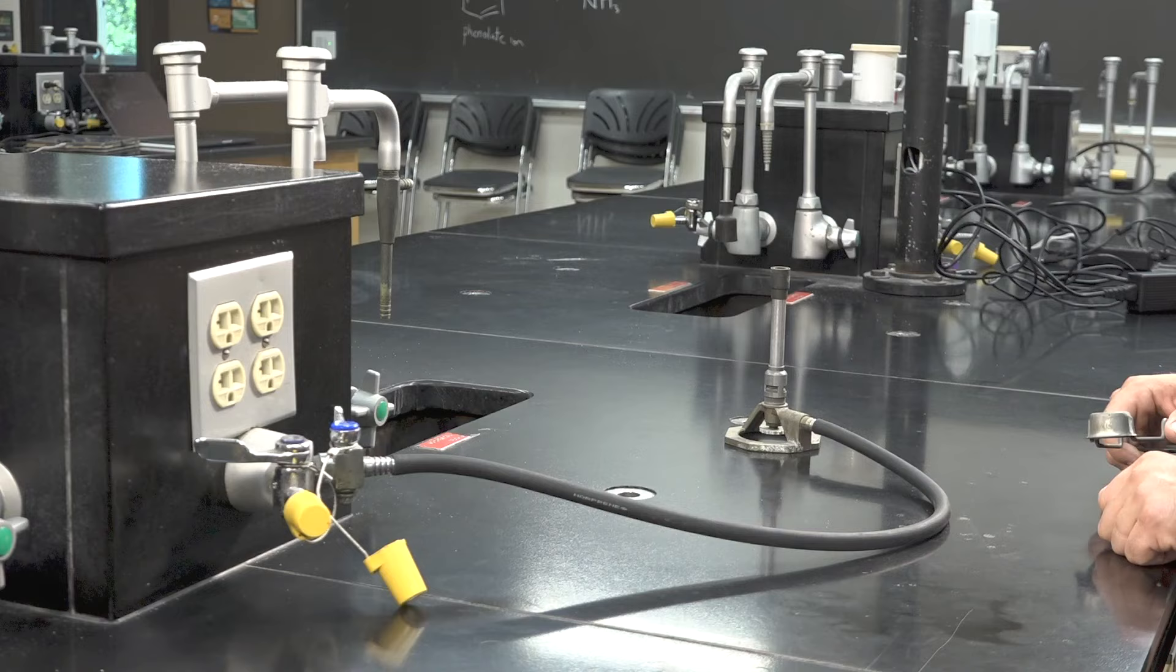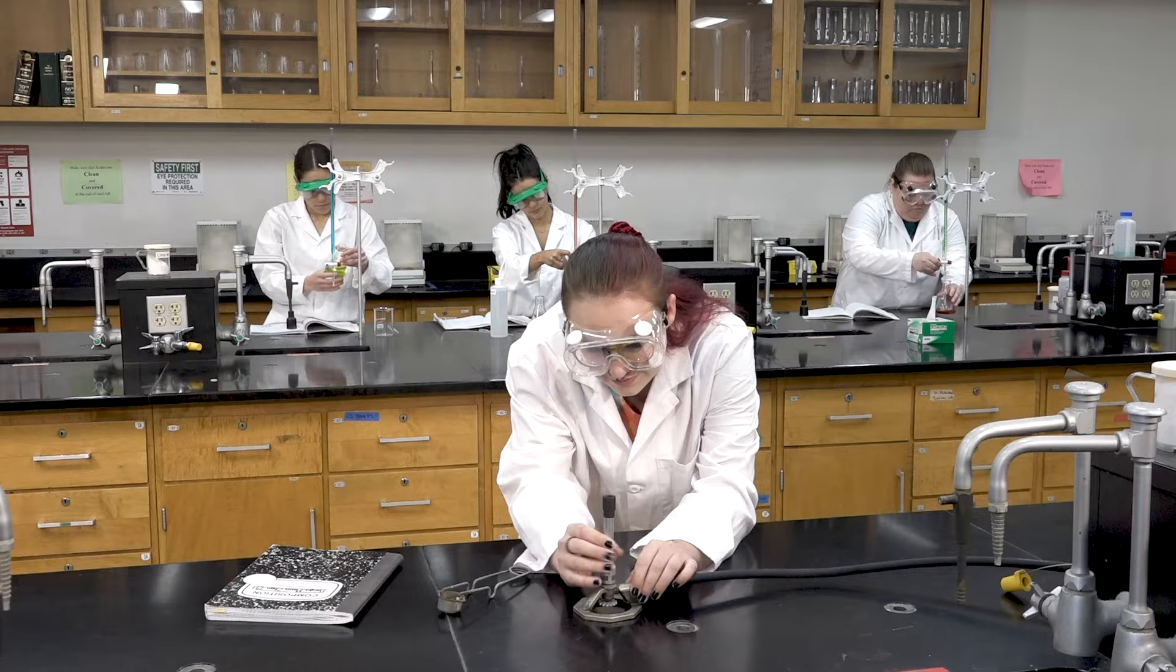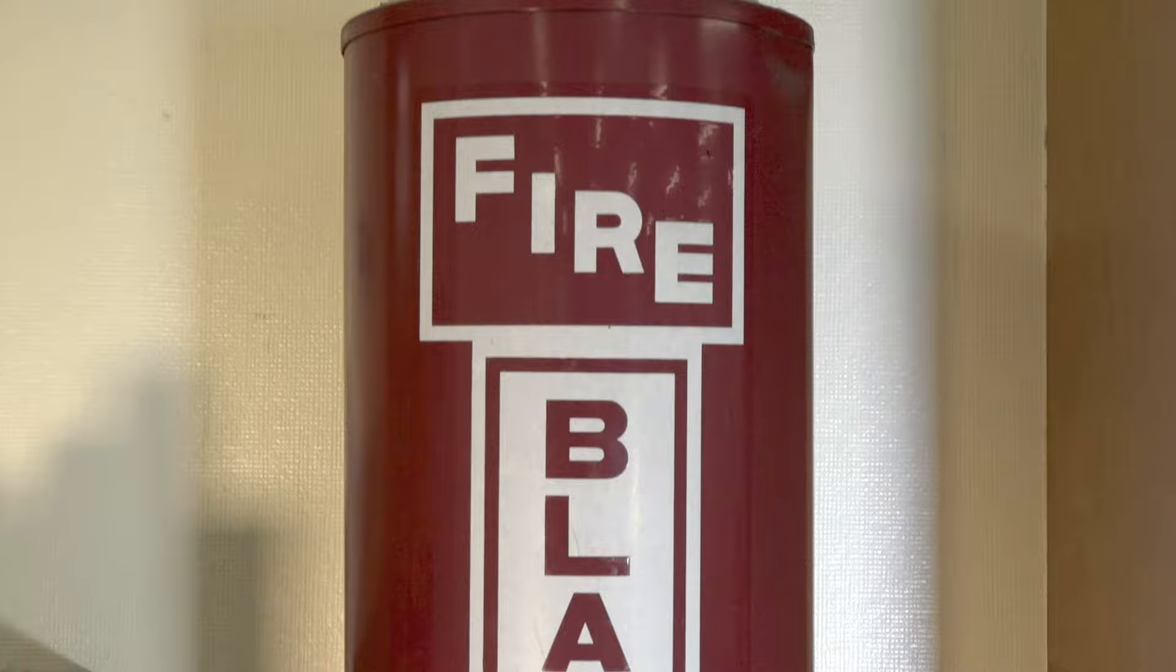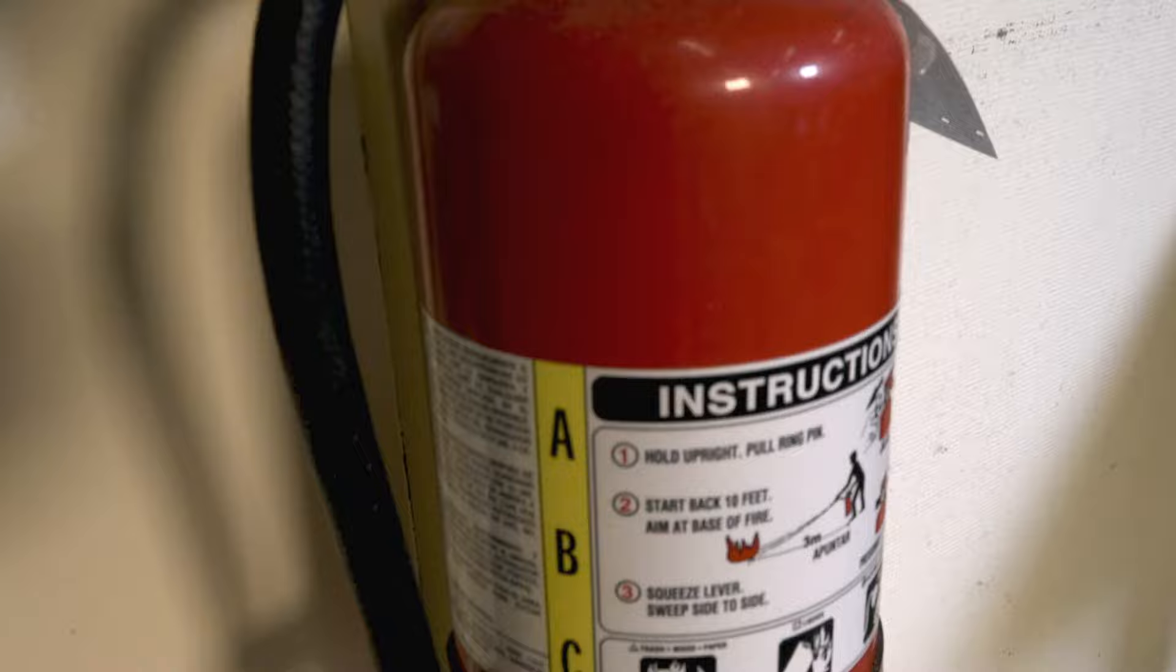Chemists often use open flames from sources such as a Bunsen burner. Because of this, there is a risk of fire. In the event of a fire, taking action can prevent injury, so make note of the fire-suppressive equipment around the lab. There is a fire blanket made out of sturdy fire-resistant material. For larger fires, there is a fire extinguisher located in every lab.